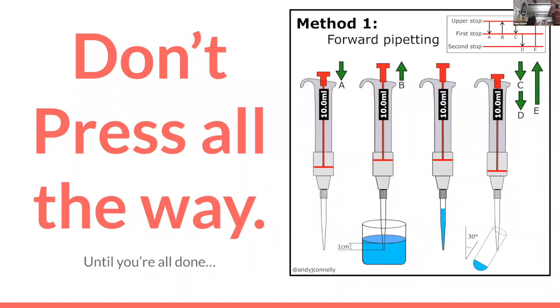try and stand in front of where the camera can see me. There's this button on top. This is the one button that does pretty much all the show. You press the button and there's a place where it gets harder to push. That's the first stop. So when you first do it, you'll press down to there and then let up. And then when you're trying to get rid of it all, there's another stop, you can press beyond that. So here, and then go again, and then you let up from there. It doesn't necessarily make sense until you have one in your hand.